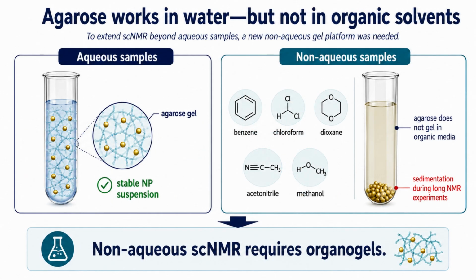We previously solved this problem in water by suspending nanoparticles in agarose gels, but many ligand nanoparticle systems of interest are studied in organic solvents, and agarose cannot be used broadly under those conditions. In this work, we set out to extend surface contrast NMR to non-aqueous environments.